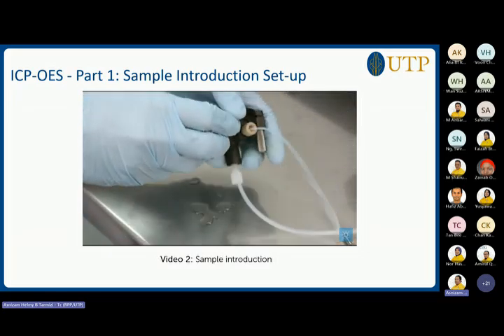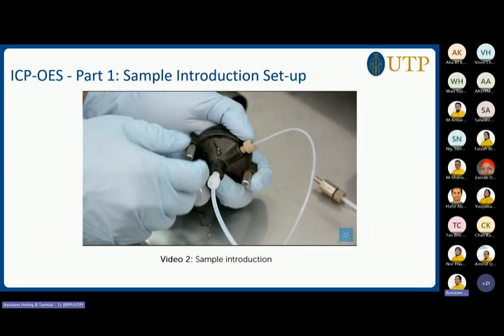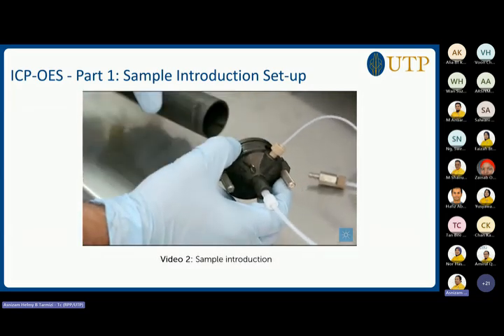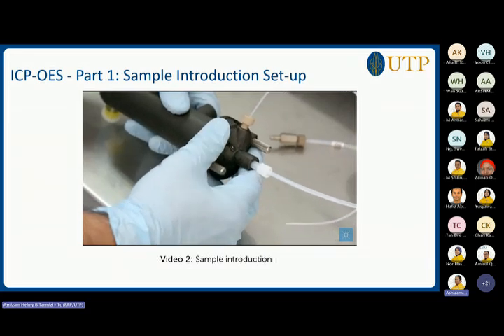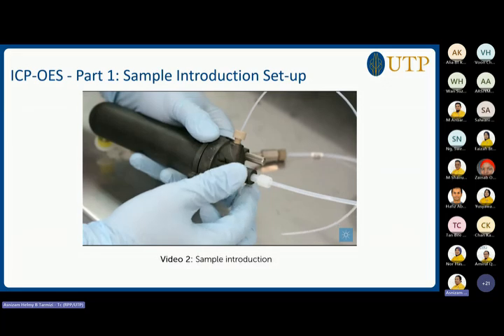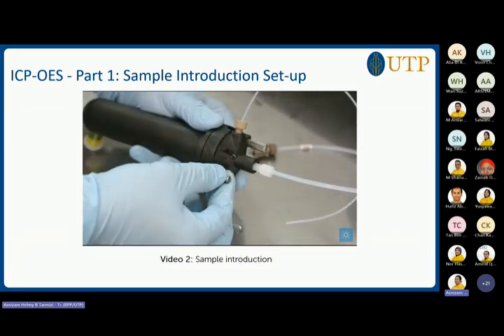Gently tighten the two knurled screws to the end cap. While supporting the spray chamber, position the end cap assembly and gently push and twist the end cap until it sits firm onto the spray chamber. Tighten the two screws.